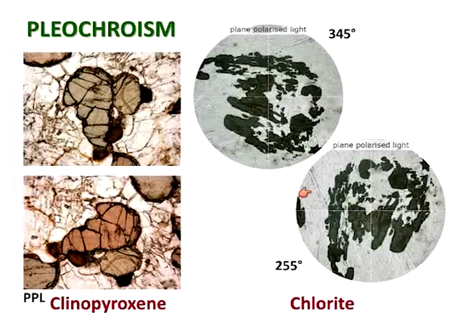And that's just purely rotating it through 90 degrees. And to my eyes, the lower disc, the ground mass, is paler, very much nearer colourless. And then the top panel has a stronger colour, whether that's blue or green or a kind of bluey green. That's up to you, really. But it is a very, very subtle change, and it's those changes, again, that you're looking for with pleochroism.